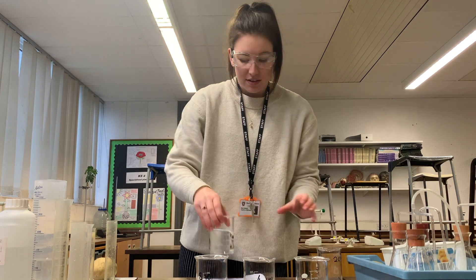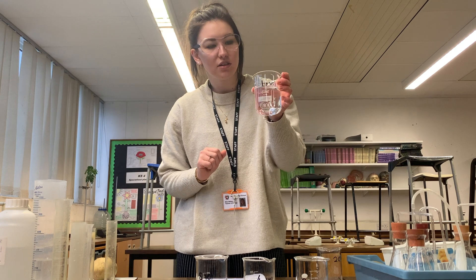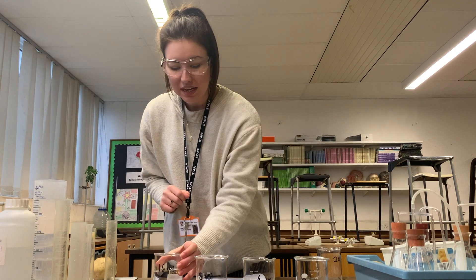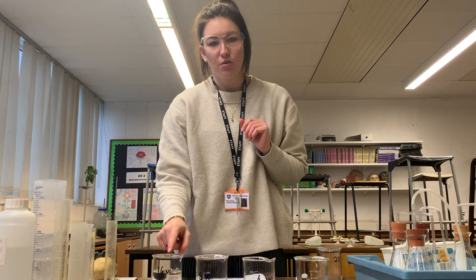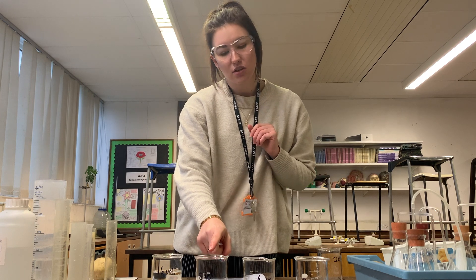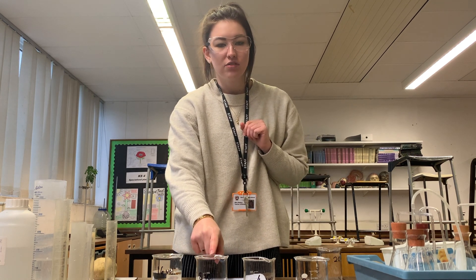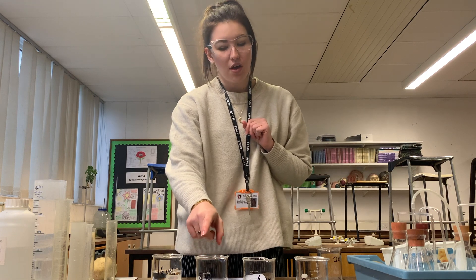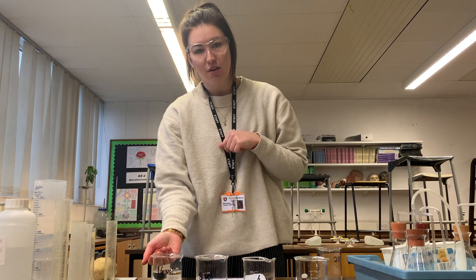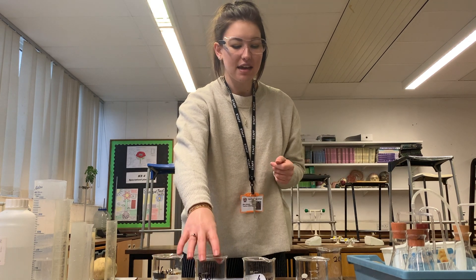To do this serial dilution, we currently have 200 centimetres cubed of a 16 vol solution. If I take 100 centimetres cubed of that 16 vol solution and mix it with 100 centimetres cubed of distilled water, we will have 200 centimetres cubed in total of an 8 vol solution — half 16 vol and half distilled water.